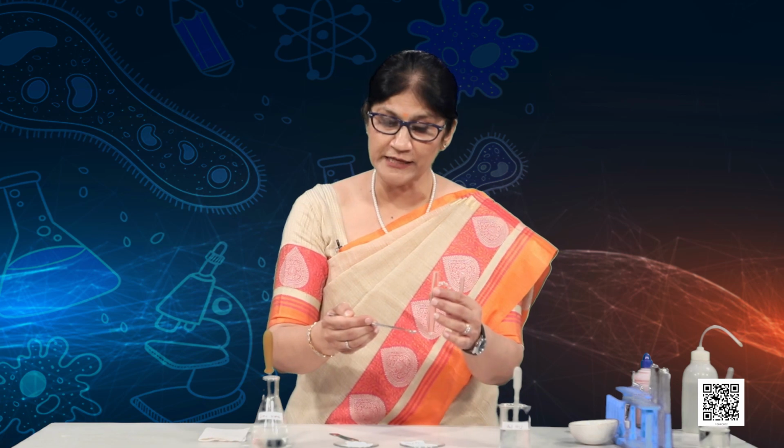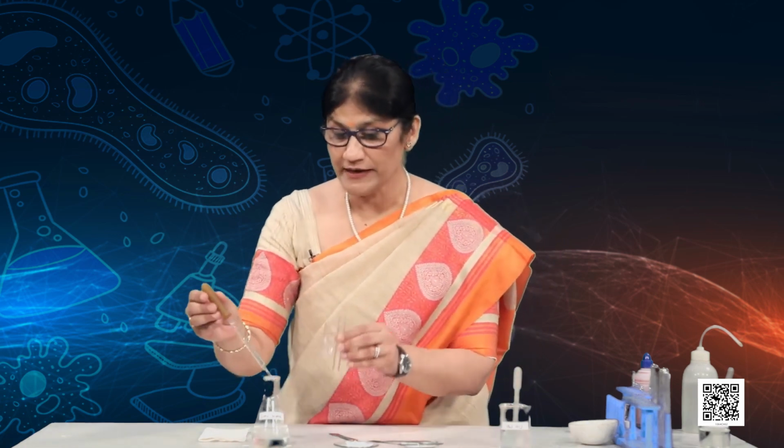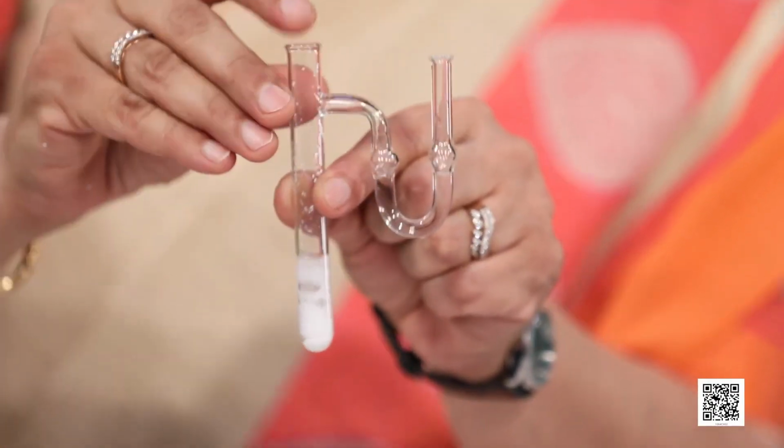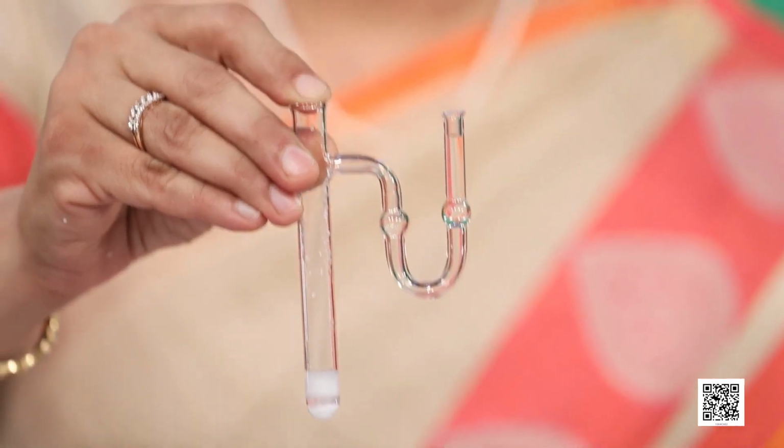So, again I have my U-tube, and in this U-tube I will put some sodium carbonate in the test tube, let us put some lime water in the arm of the U. Okay, yes, there goes the lime water. And now let us put some dilute HCl.